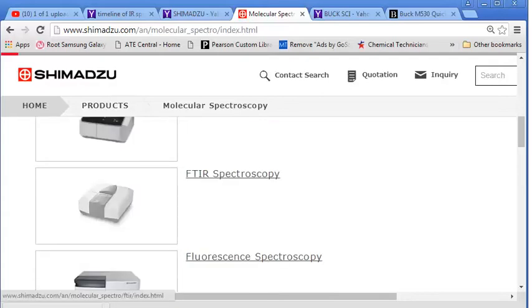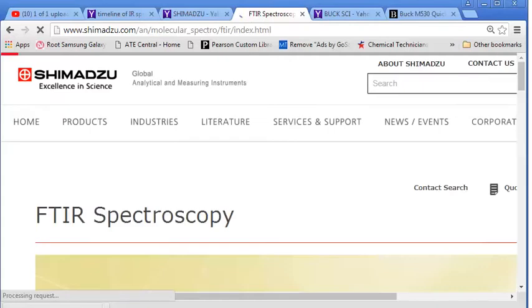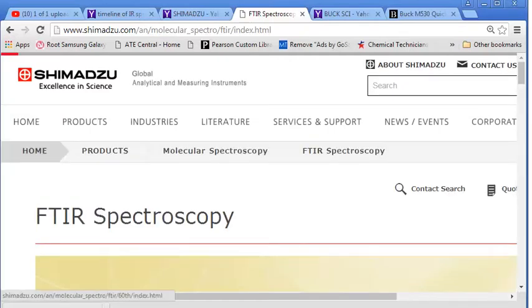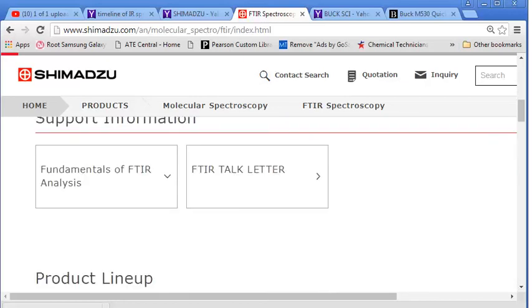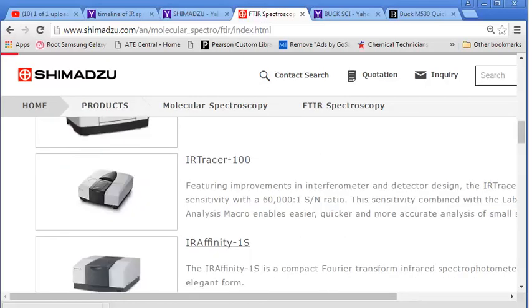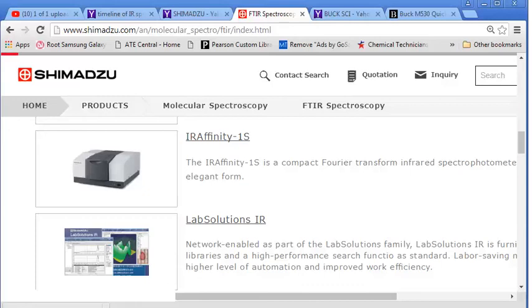and you will also see their FTIR. And the IR stands for infrared, of course, but we've not really talked about what the FT stands for yet, and we will, because this is an instrument that you would see, and it is an instrument that we have that really sets us apart. So we'll talk about FTIR, what that is and what that means, but it gives you a picture of the FTIR systems.